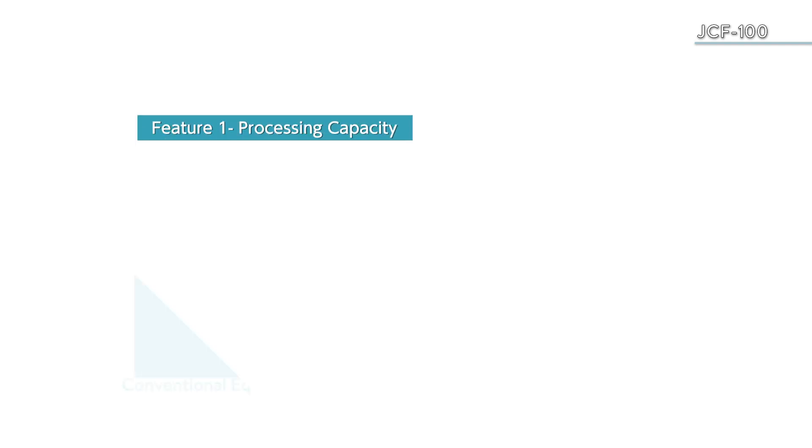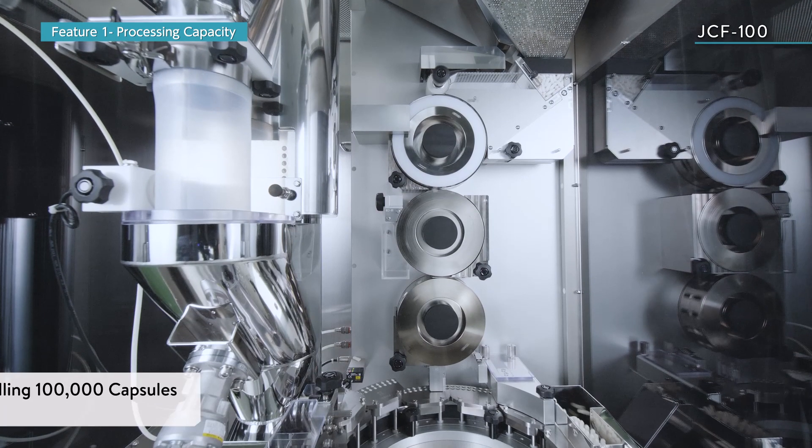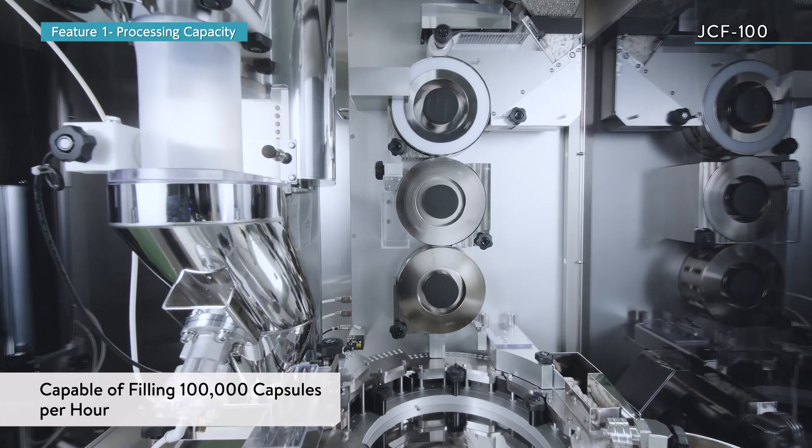The JCF-100 has an increased paddle size, which enables it to fill 100,000 capsules per hour.